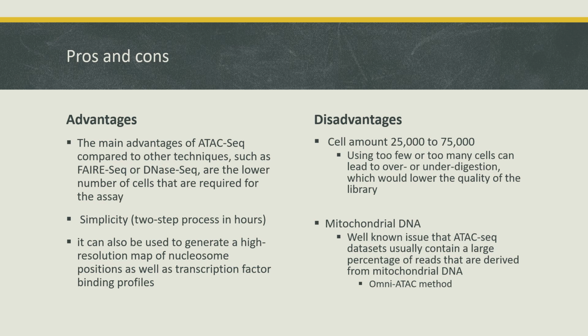There's also a well-known issue with ATAC-Seq that there is a lot of mitochondrial DNA in the data sets, and they've actually come up with a potential solution, the Omni-ATAC method, which uses a detergent to remove mitochondria from the samples prior to the sequencing.